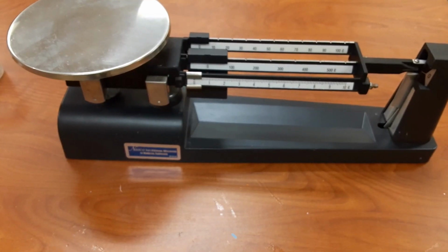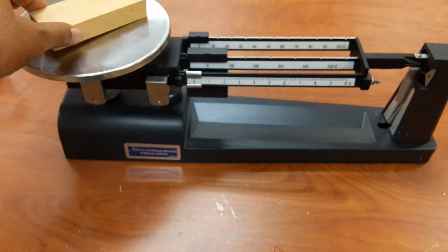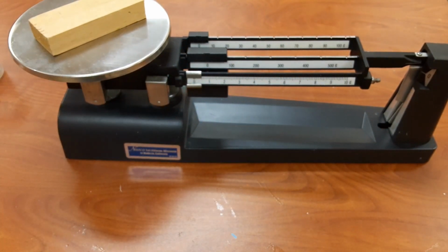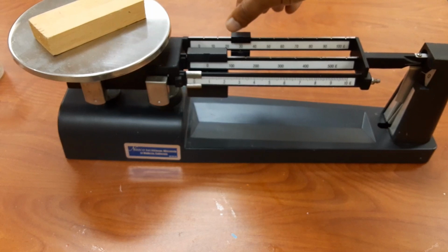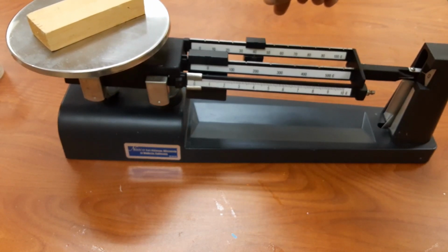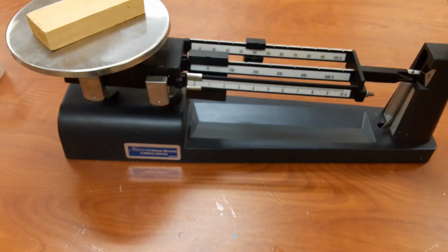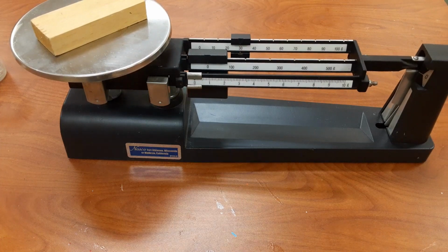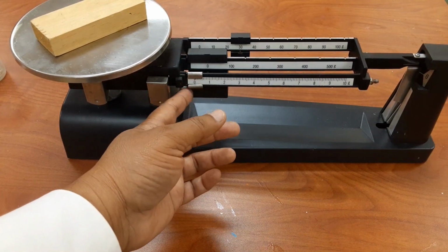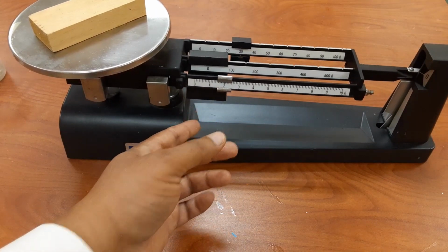Next we want to find the mass of this block of wood. So we put this block of wood on a triple beam balance, and how the triple beam balance works is there are these three beams and we move these sliders until the beams are horizontal. So when I move the last slider to 40, the beam dips down, which means 40 is too much, so I move it back to 30, and now the beam goes up, and now I'm going to move this small slider until the beam becomes horizontal.